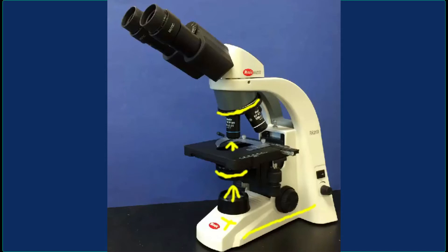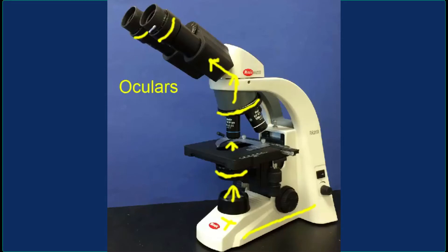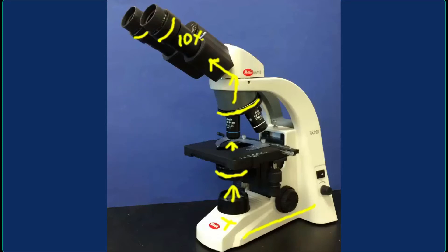The light then goes through a prism that's housed over here, and then it is refracted in this direction. It finally goes through these lenses, and these are oculars — also simply referred to as eyepieces. They give you 10x magnification, so they are going to magnify whatever image is going into this lens ten times.